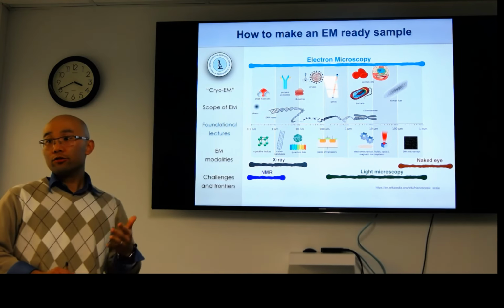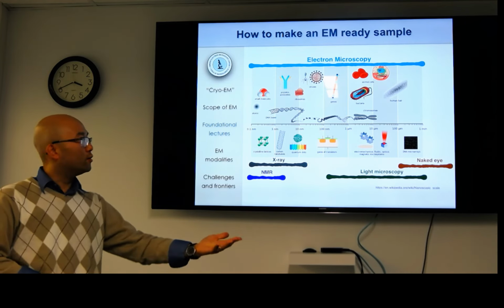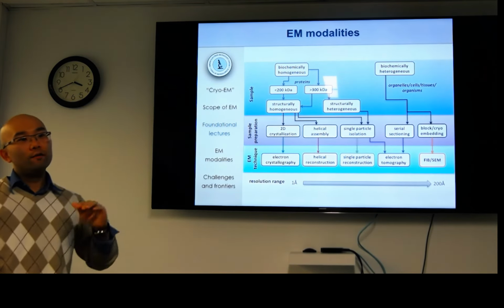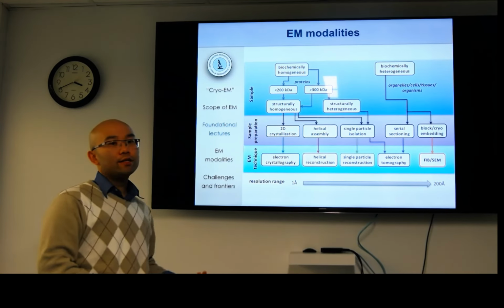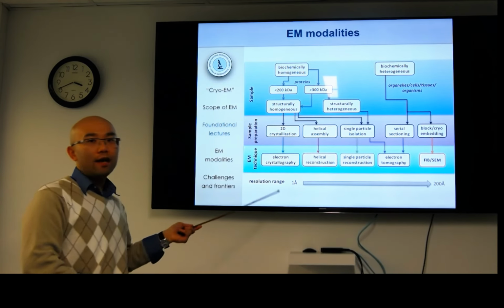An electron microscope is a microscope, and if you want to get higher and higher resolution, well, you just crank up the magnification. If you want to see an organism, well, you just lower your mag. But there's a catch in that you have to prepare the sample to be suitable for the instrument. And how we prepare the sample, one may not be able to look at the same sample at the micron level as you can look at in the angstrom level.